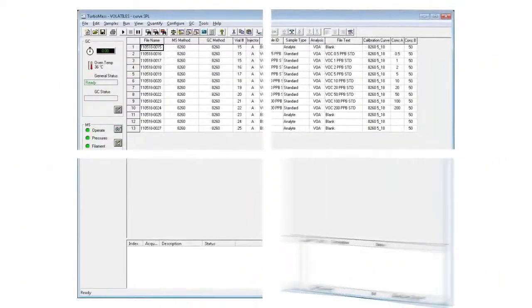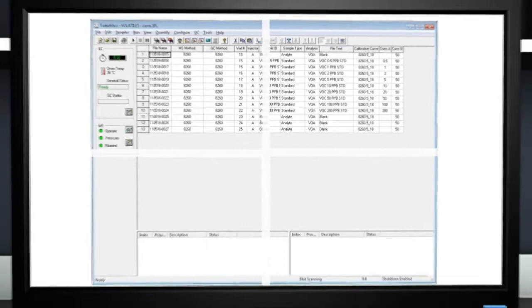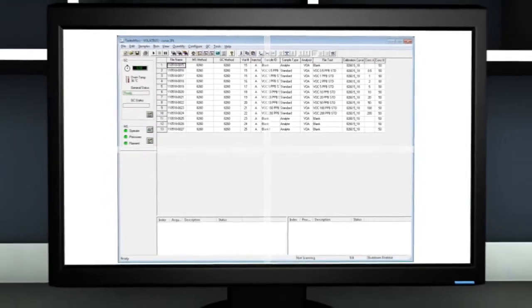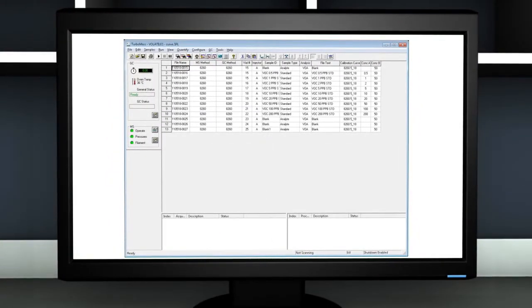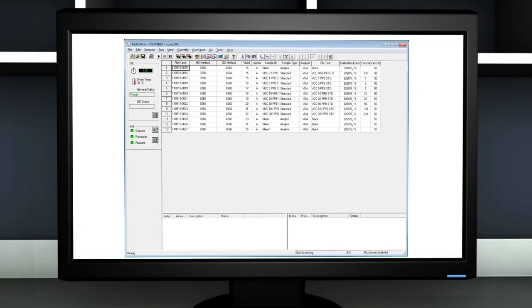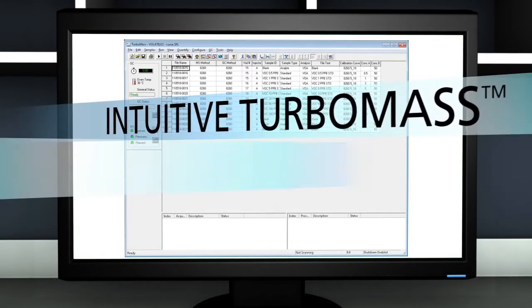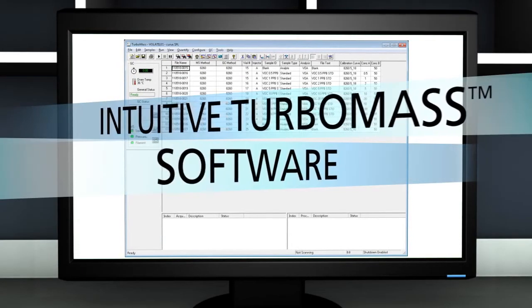No matter which front-end system you choose, your CLARIS SQ8 GC-MS delivers exceptional ease of use from sample preparation to sample data through the instrument's TurboMass software.